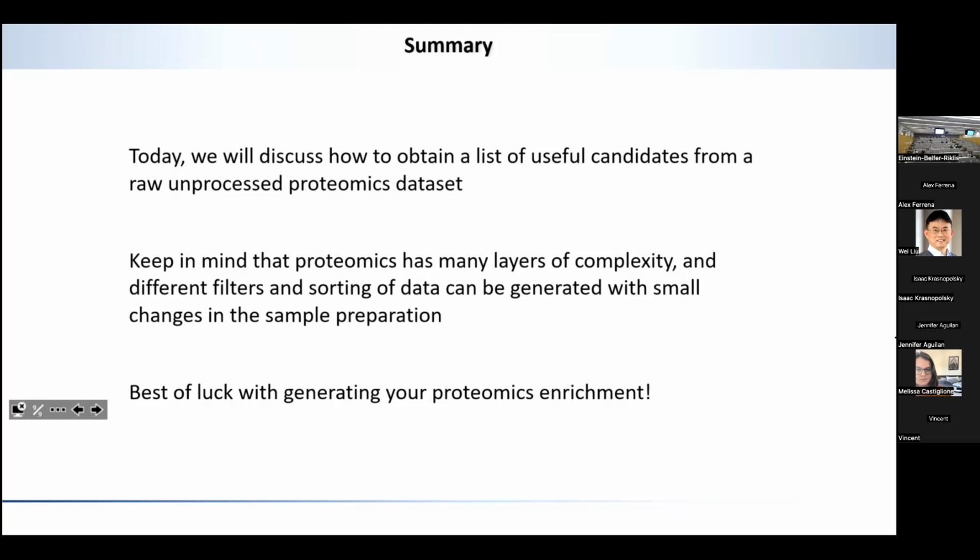So when you analyze transcripts, I'm not an expert, but you have all of these sequencing reads, you put them on top of each other, you count them until you have an area, and that tells you the intensity of your signal. When we do proteomics, we have profiles in our chromatograms, right? And then when the signal comes into the instrument, you get a signal intensity.